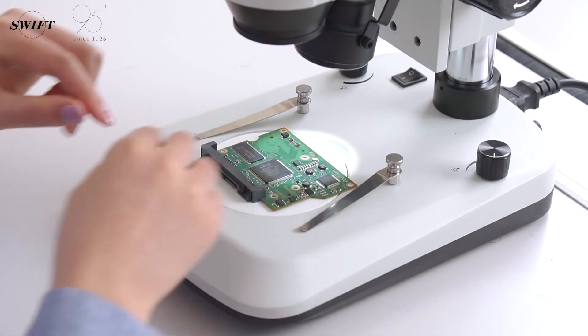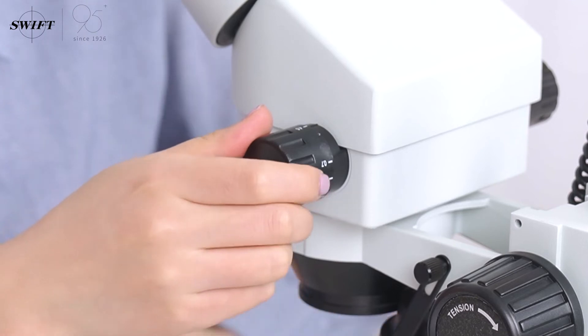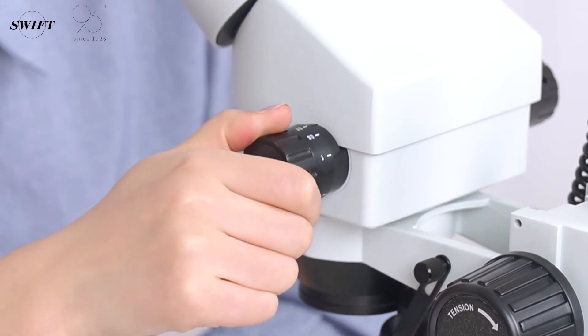Put the industrial circuit board to be observed on the workbench. Adjust the zoom hand wheel to low magnification and use a large field of view and a large depth of field to find the target.